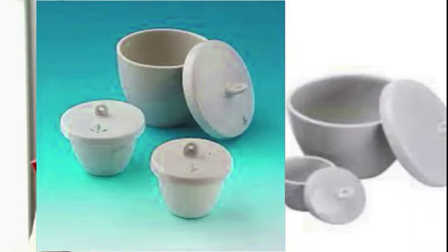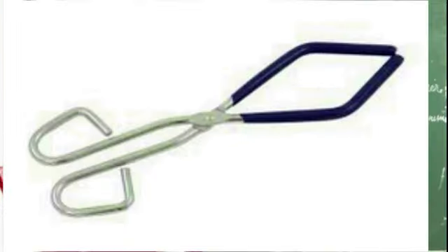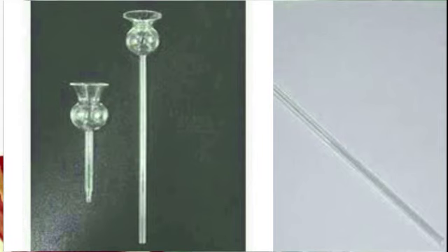See this picture. This is crucible and cover. It is made up of porcelain. It is used when a substance requires strong and direct heating. Then pair of tongs. This pair of tongs is made up of metal. It is used for picking up some apparatus like crucible. Then thistle funnel. Thistle funnel is a bulb-shaped reservoir with a stem and stopper. It is used to transfer the liquid in a controlled manner.